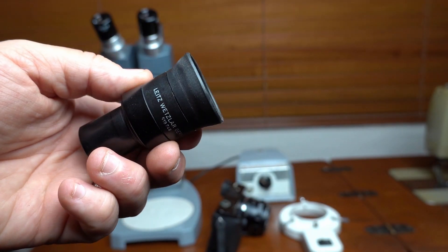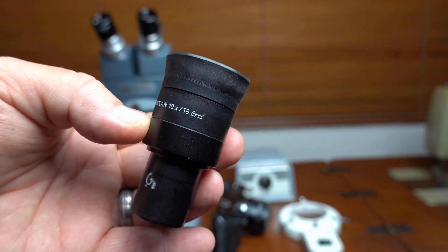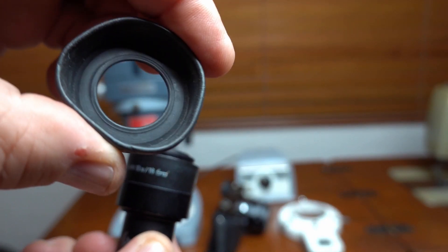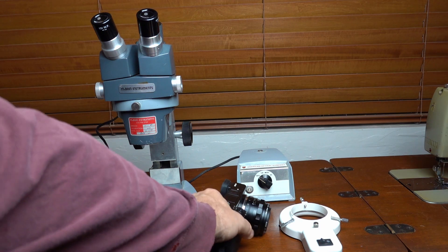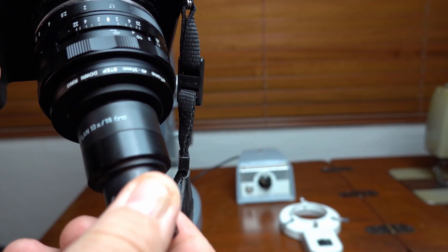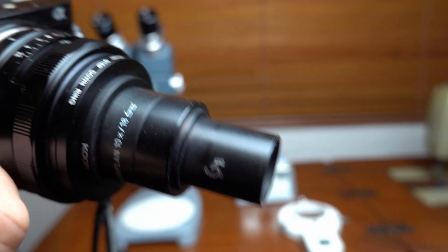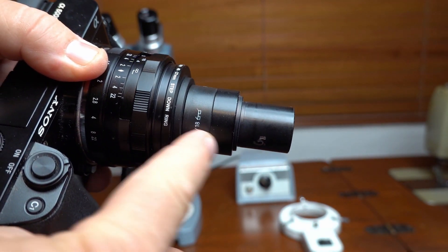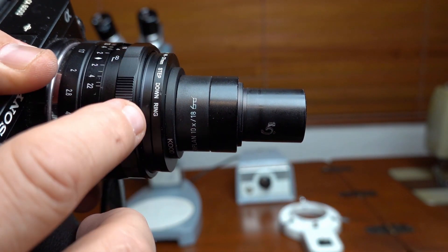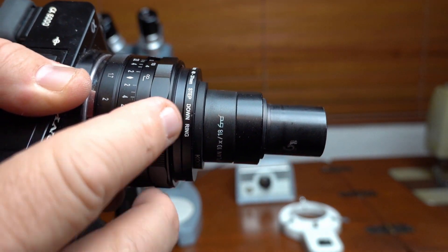Then I get a Leitz 10 power eyepiece — it's got the little eyeglasses symbol on it, which means it's a high eye point. The great thing about these lenses is that you can screw off the rubber eyepiece cup, which you use for glasses, and it has a 28mm thread on it, so you can screw it into the second step-down ring. Now you've got a nice little afocal system. You've got the 10 power eyepiece, which replaces the 10 power eyepiece that's on the microscope, and your lens is set wide open at f1.7. It's a 35mm, which works pretty well, and you set the focus on the lens to infinity.